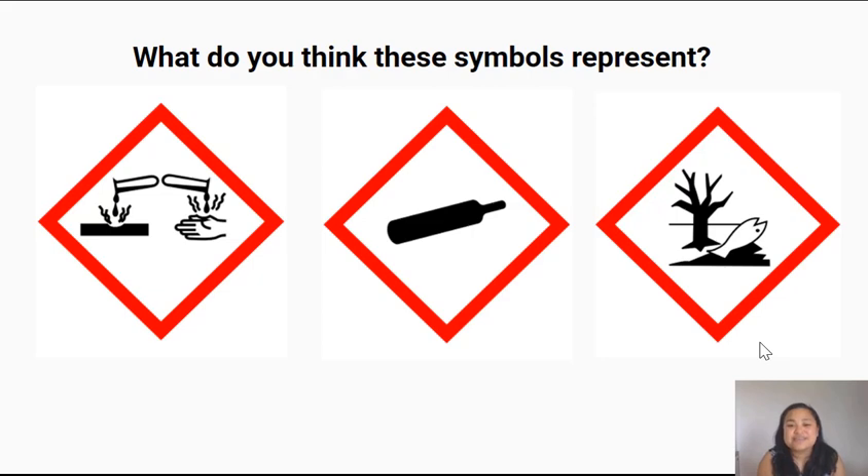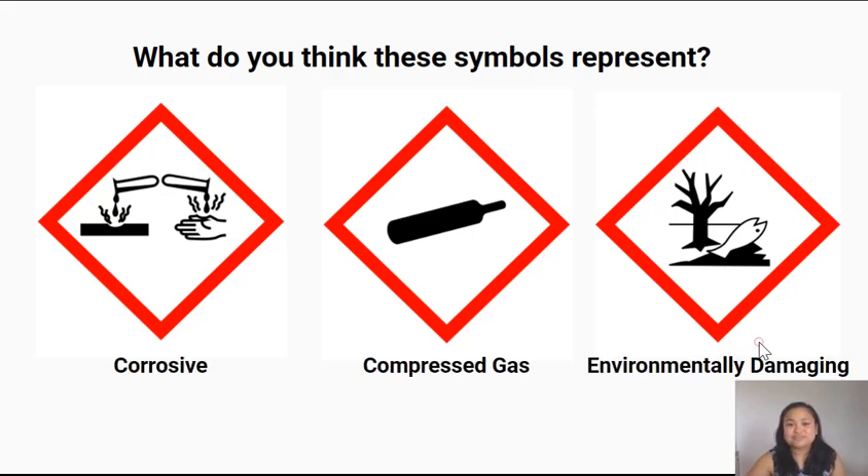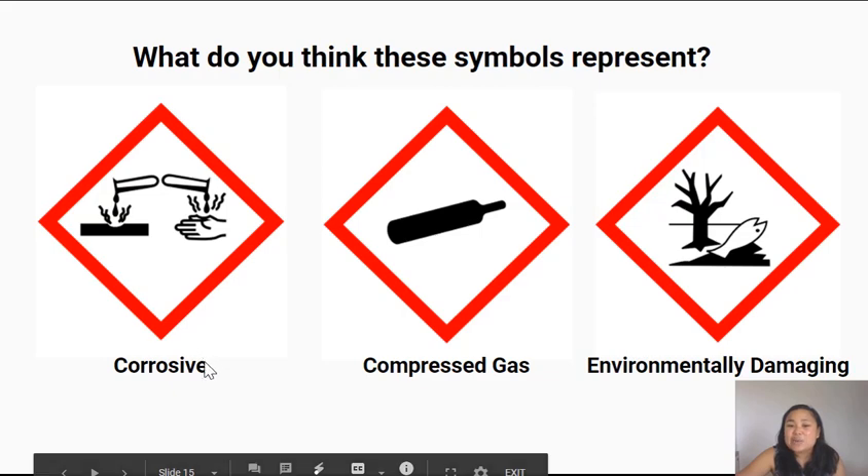Here are three other symbols. Turn to the person next to you and take a guess at what you think these symbols might represent. In this symbol it looks like two test tubes or boiling tubes filled with liquid being tipped over, with the liquid hitting a solid surface or someone's hand or body parts. When the liquid hits it starts to eat away at the surface or body part. This symbol represents that something is corrosive — it can eat away at a thing.